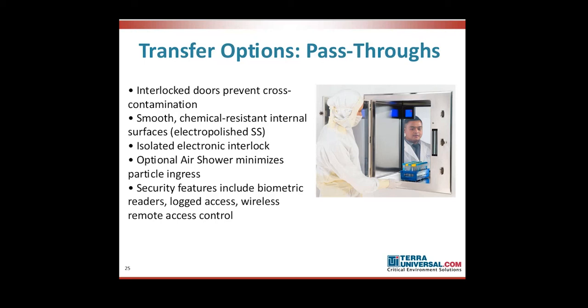Thank you, Mike. Well, I think the audience is pining for an answer from Dr. Munoz. Question number 6, can we prepare low and medium risk CSPs within the same ISO 5 laminar flow hood?